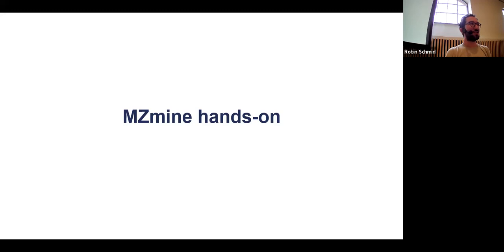But maybe also just search on some of the tools, like, hey, do you have problems with Agilent, with Sciex, with Waters, with Bruker, and so on, right? Just search on MZmine and you're going to find some of the names popping up more often. Maybe that was old, like a couple of years ago, but at least this is something to ask them, because open data is not supported the same way by all the vendors.